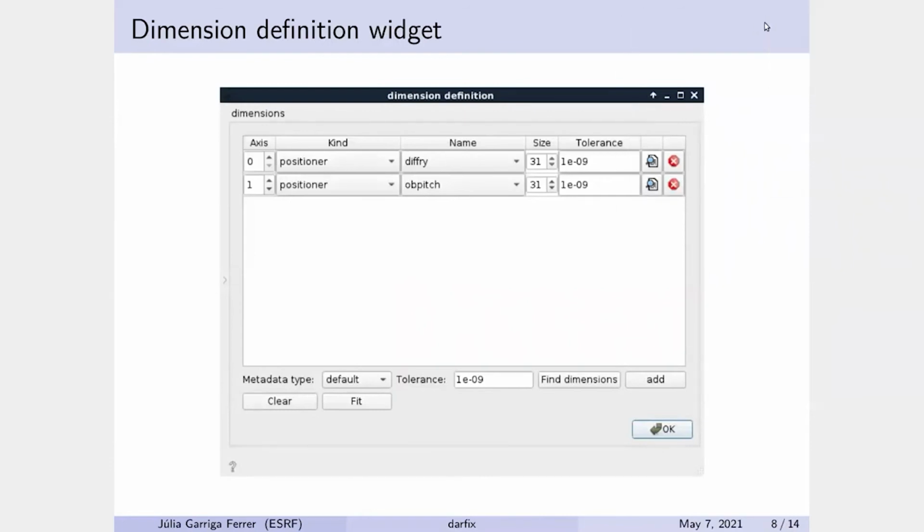My question is, is it possible to define a pseudo motor that represents a movement of two different motors? Because in these rocking and rolling scans, to go to the proper rolling angle, you need to move both chi and phi motors in the current setup, and also d phi y actually. So you need to do such a correction of these three different motors to reach the proper rotation, what we call chi rotation right now, but roll rotation. I'm just asking whether that is possible to do.